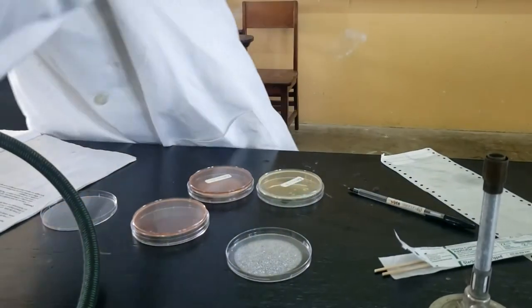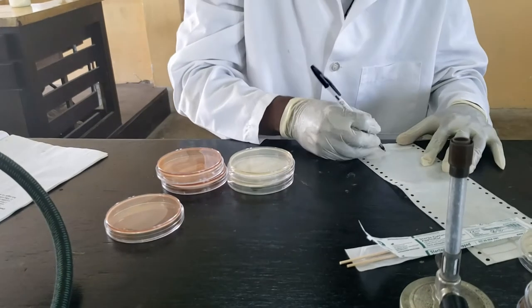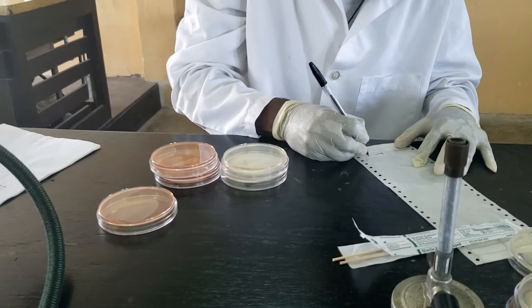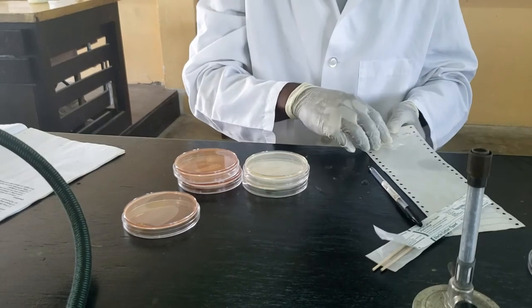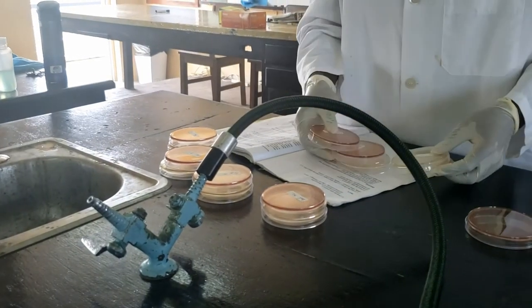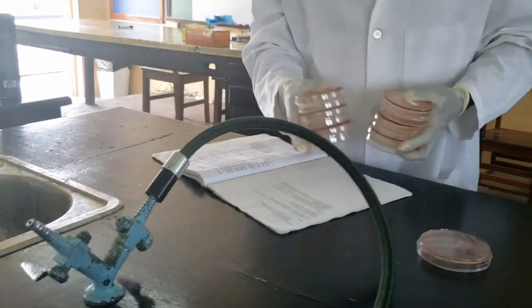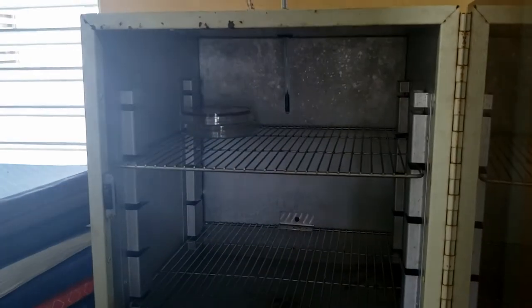Those, and then finally we can close these ones. These are two plates that were left exposed on the table for 30 minutes. Now that we have all of these ready, we can move over to the incubator. So we're just going to set these on a shelf inside the incubator.